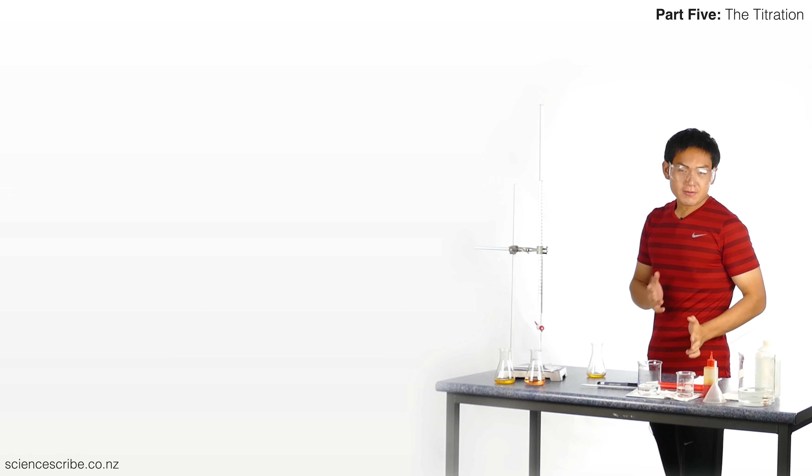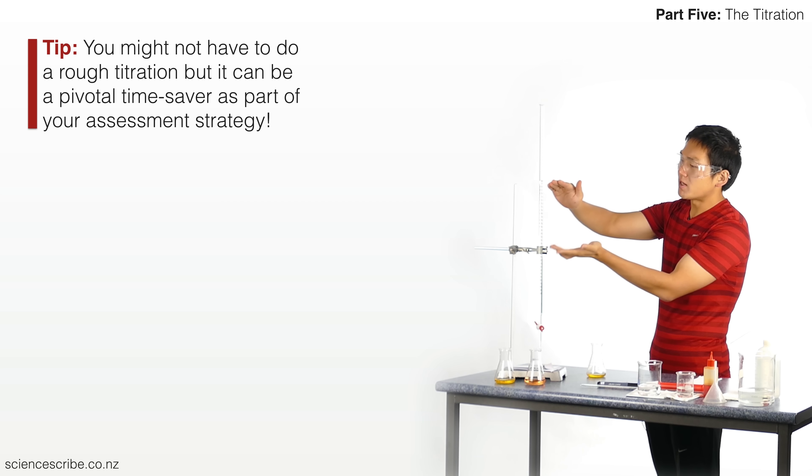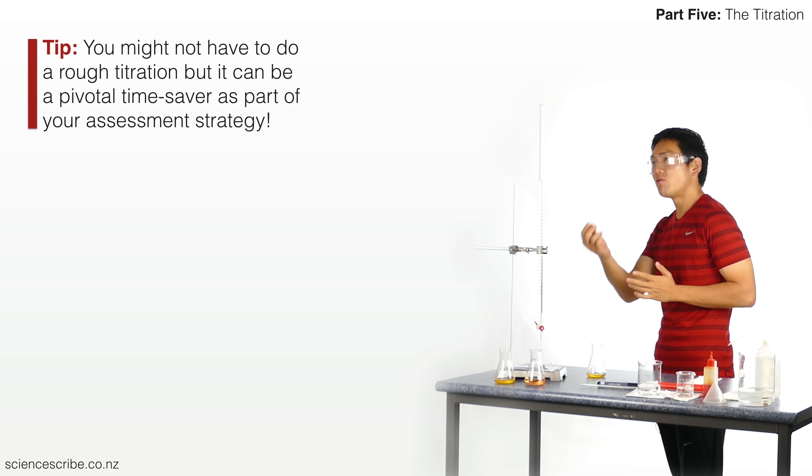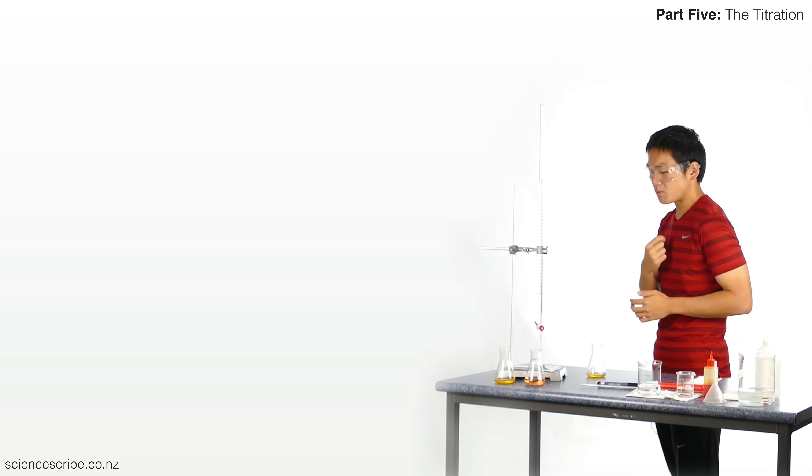The reason for doing the rough titration was also so I could get an estimate of how much volume I needed for my burette. Remember, we don't want to waste time adding one drop at a time. We want to get through our titrations as quick as we can while not compromising on the quality.